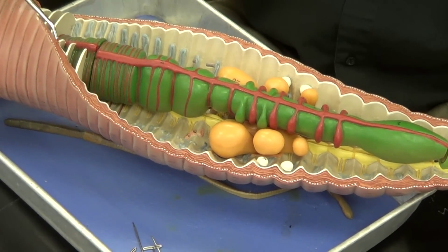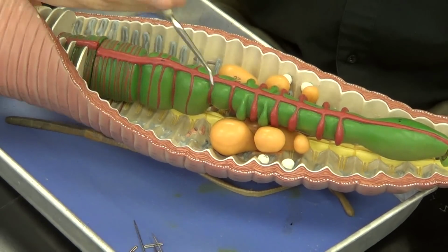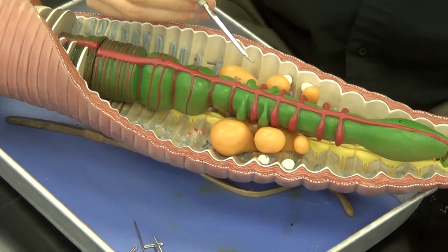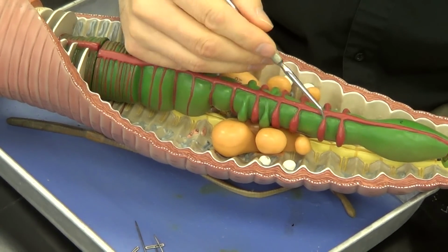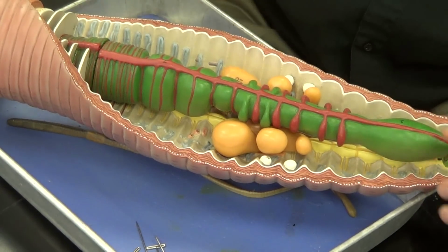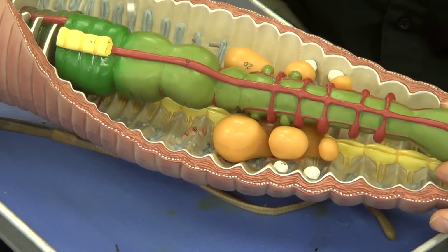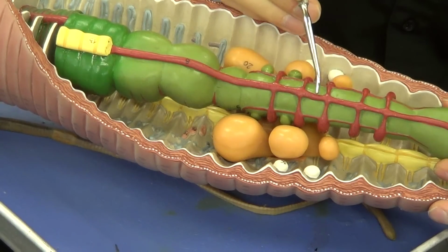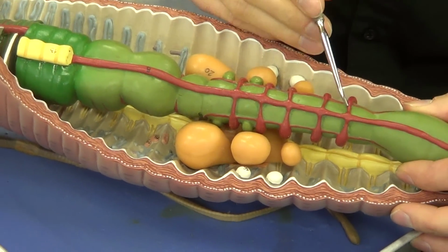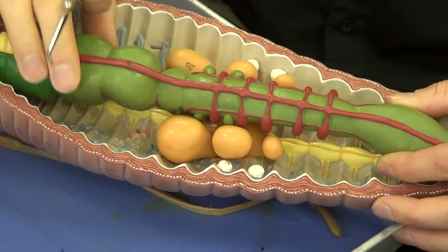They are modified blood vessels, and that's exactly what a human heart is. It's a modified blood vessel, except it's become more modified and more specialized than the heart of an earthworm. Usually you'll have about 5 sets of these hearts, and if you're lucky you'll see 2 or 3 on an actual dissection. If I turn this over, on the underside, the belly side of the earthworm, you'll see another blood vessel. And this is called the ventral blood vessel because it's on the ventral aspect. And this blood vessel actually returns blood back to the body of the earthworm.